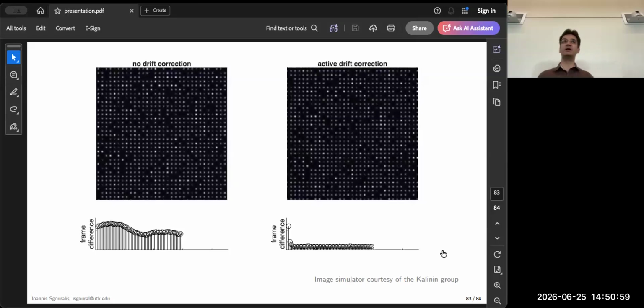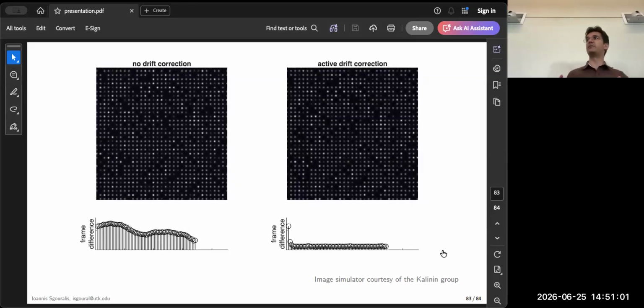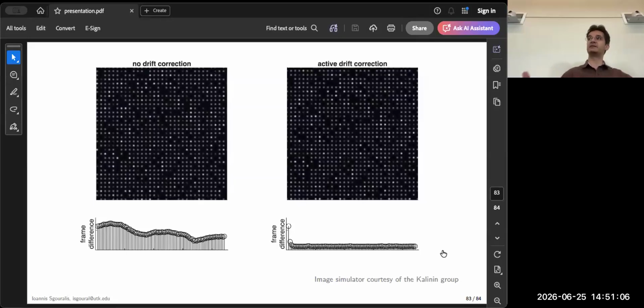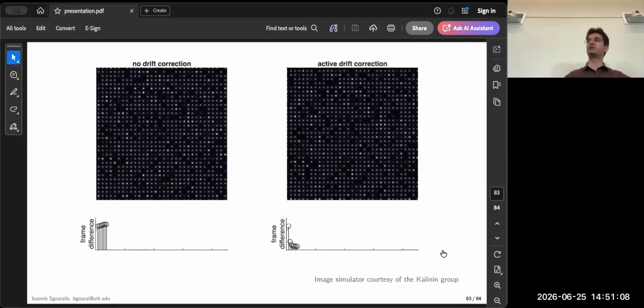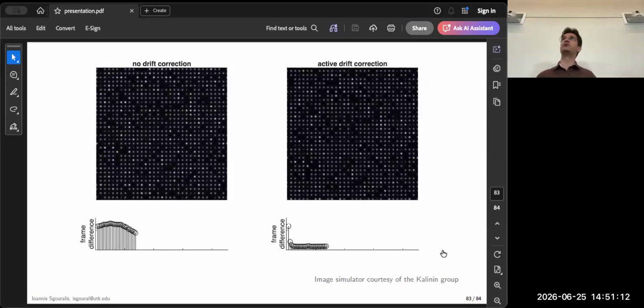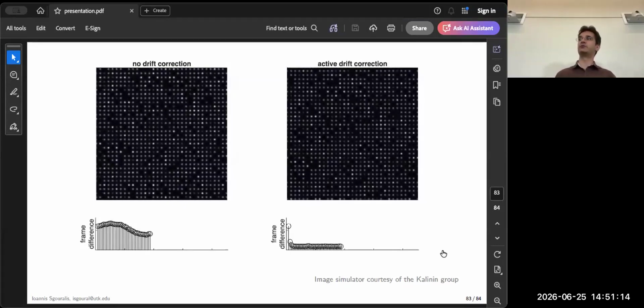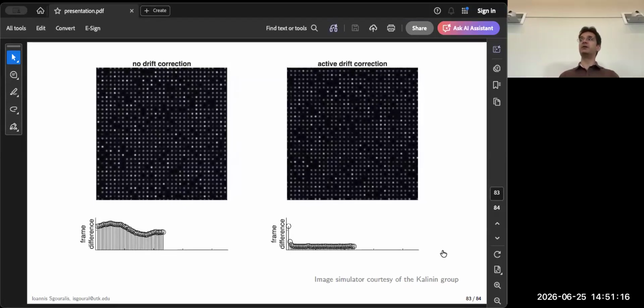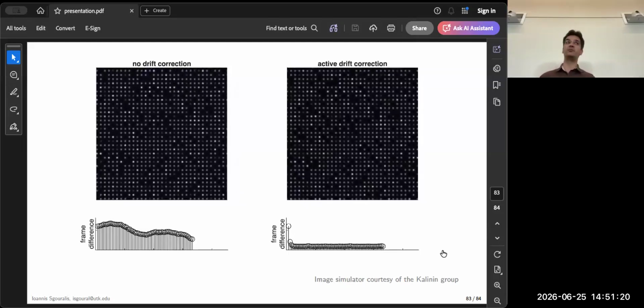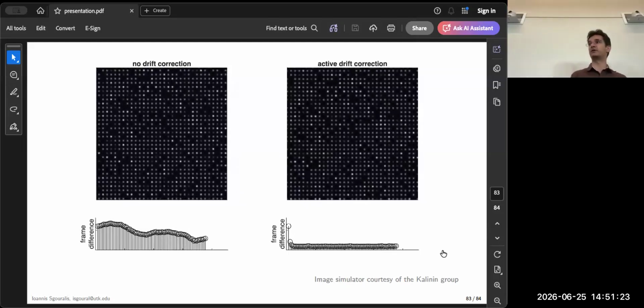And as I mentioned in the beginning, this is a very different problem, simply because we need to apply completely different methods to correct the signals that the instrument needs to respond. The problem here is that we typically need to follow reconstruction procedures, which are very expensive. So it's extremely difficult to imagine a distortion correction method that can be employed while the microscope is working.